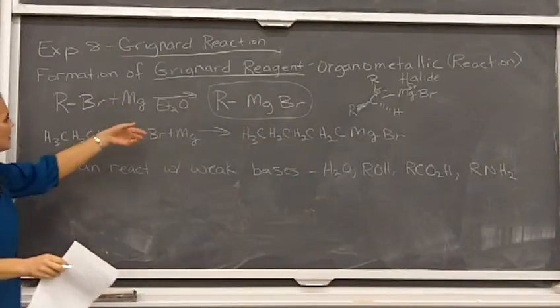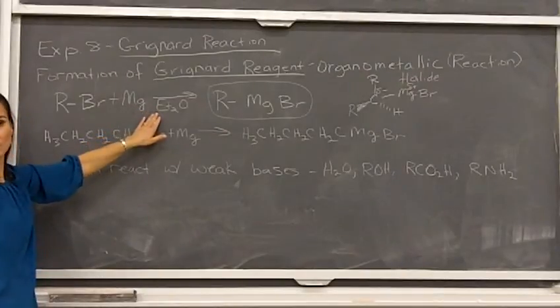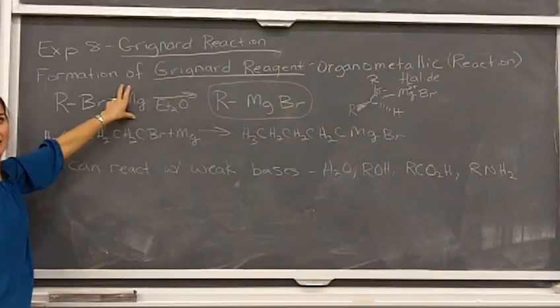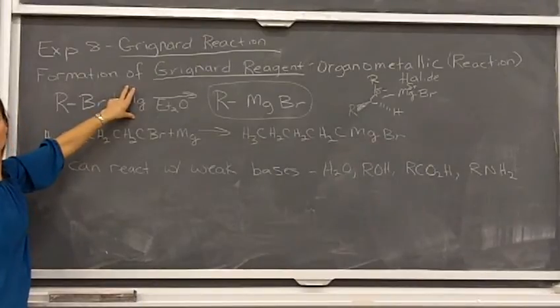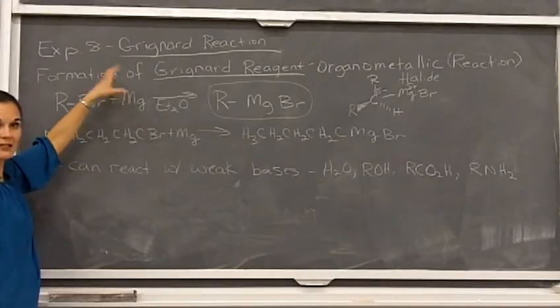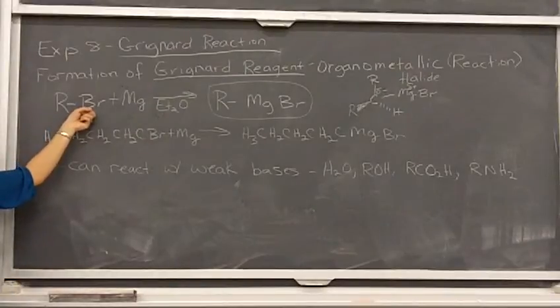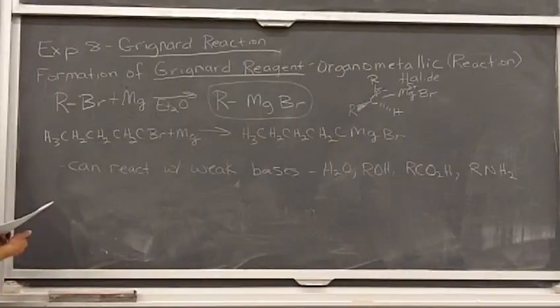Now, ether is important because of its vapor pressure. Also, the solvent is really important because you need the solvent coordinating with the magnesium. So we're talking about terms that we use with inorganic species, and the magnesium is an inorganic species. So we need that solvent to coordinate with the magnesium that helps solubilize the magnesium, bring the magnesium into solution to then react with the alkyl bromide. Okay, and so there's only a few solvents that are able to do that.